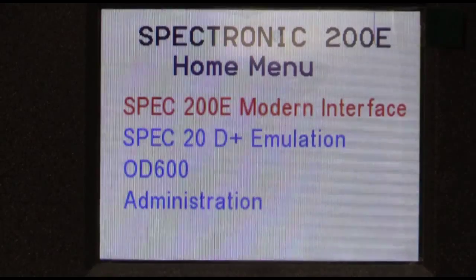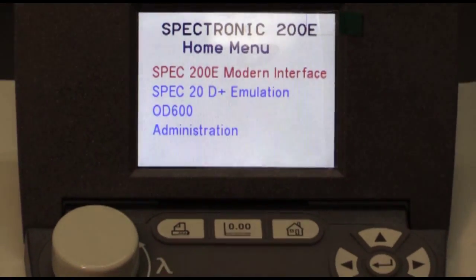Once the initialization process is complete, you will see the home menu.